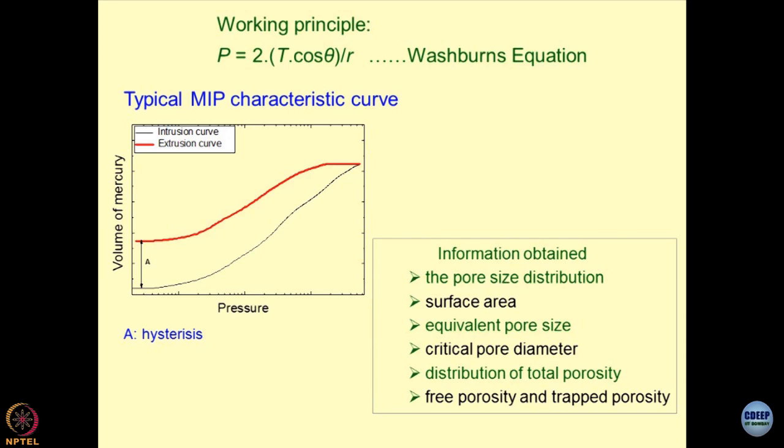Now, this is where you have to understand a few things. This pressure is mechanically applied and R is the radius of the pore, which are inversely proportional. So, higher the pressure, the R is going to be minimum. Understood? So, that means for capturing the finest possible pores in the sample, you require extremely high pressure. So, when extremely high pressure is applied on the soil sample, as you said rightly, not only the pore structure, the volume of the soil sample itself might get changed. That correction also has to be applied. So, anyway, this is what is known as the intrusion curve.